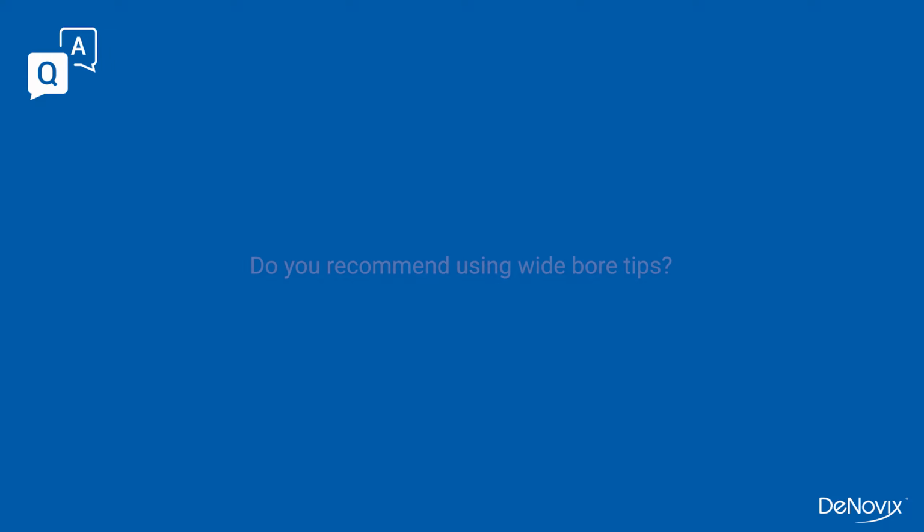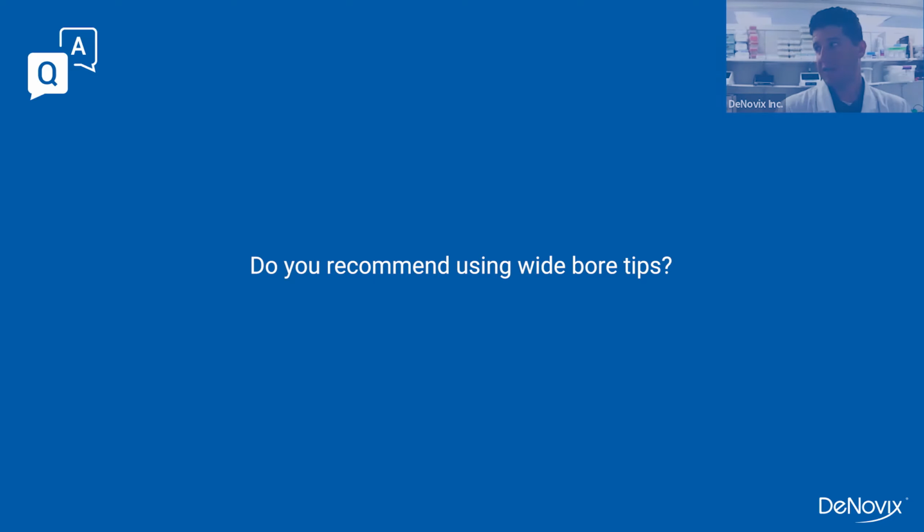Thanks. Do you recommend using wide bore tips for mixing and loading? There are several steps in the Miltenyi protocol that recommend wide bore, and in our own protocol that recommend wide bore, specifically our own. I know for a fact the homebrew buffer we used, I want to double check the Miltenyi thing before I say something that's not true.